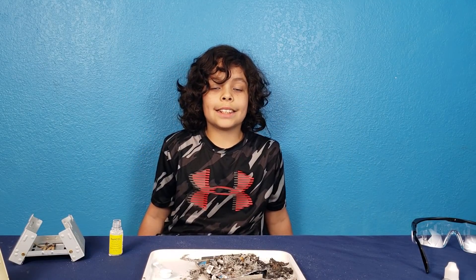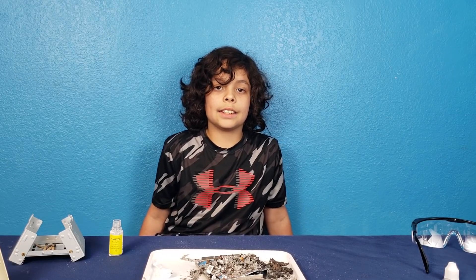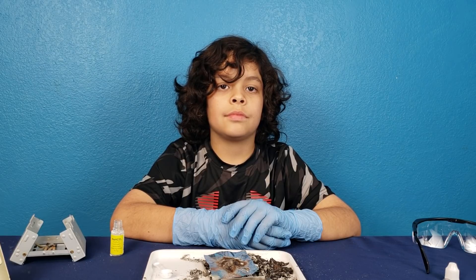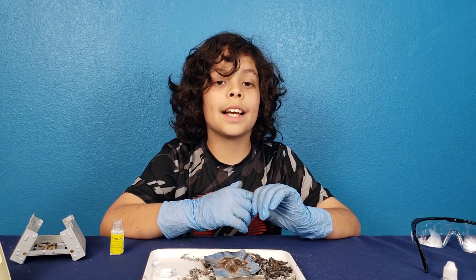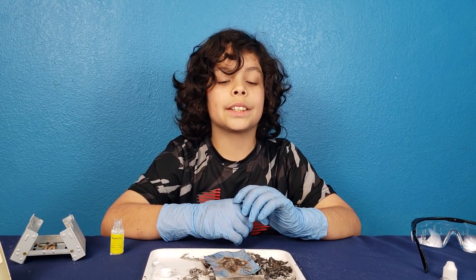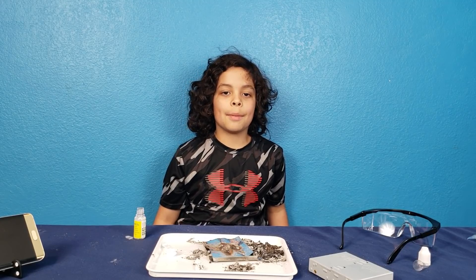MelScience is safe to do at home. I'm excited to try out the virtual reality lessons. The cool part for me is that they deliver everything that we need right to our door, so I have everything I need to do all these cool experiments. I'm not a scientist, neither is my dad, but with these kits it makes it easy.